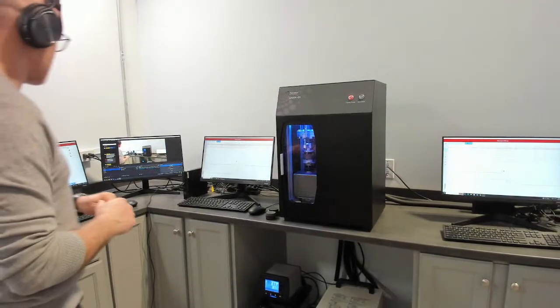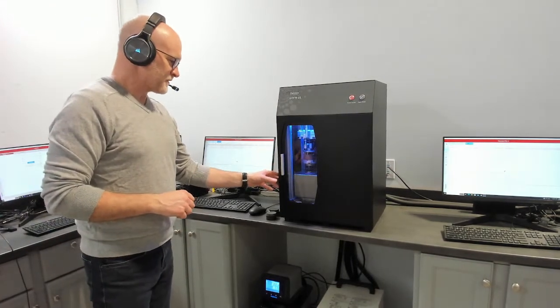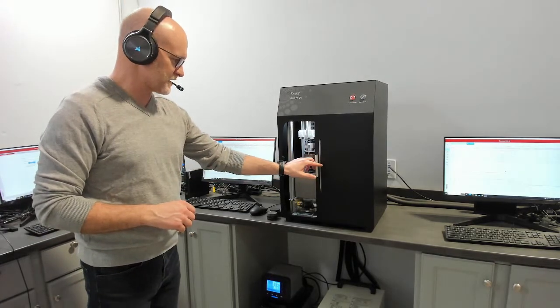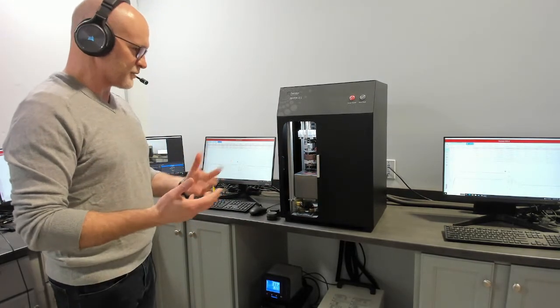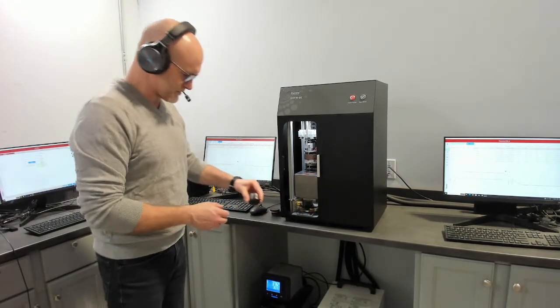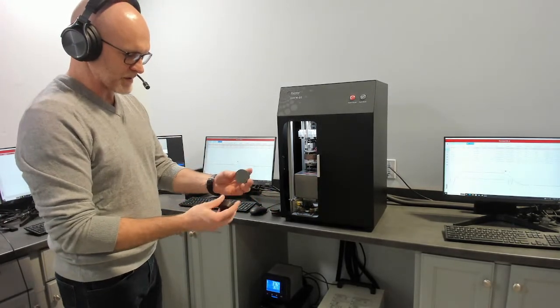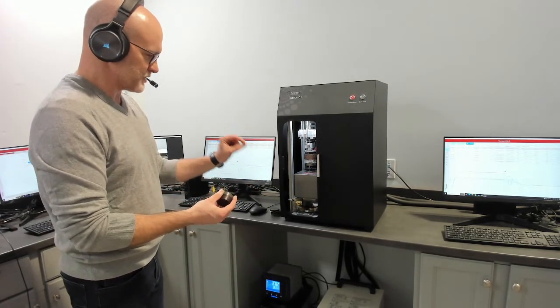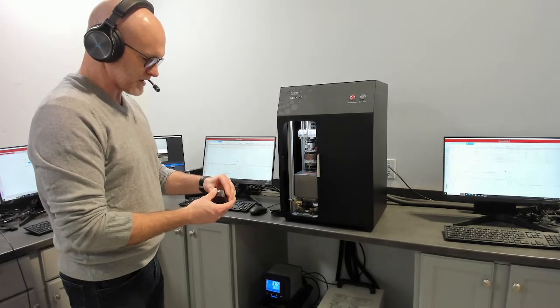This is our GHFM01 for measuring thermal resistance and thermal conductivity of complex materials. By complex, I mean heterogeneous or non-repeating layers through the thickness. So typical dimension is 2-inch diameter. The thickness can be thin film scale up to 1 inch thick.